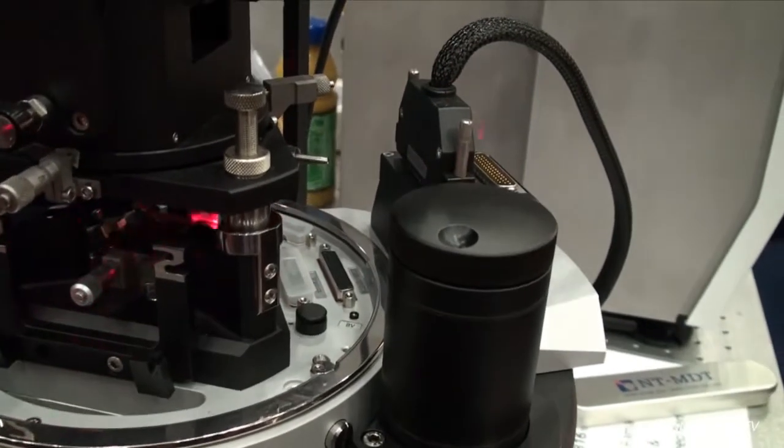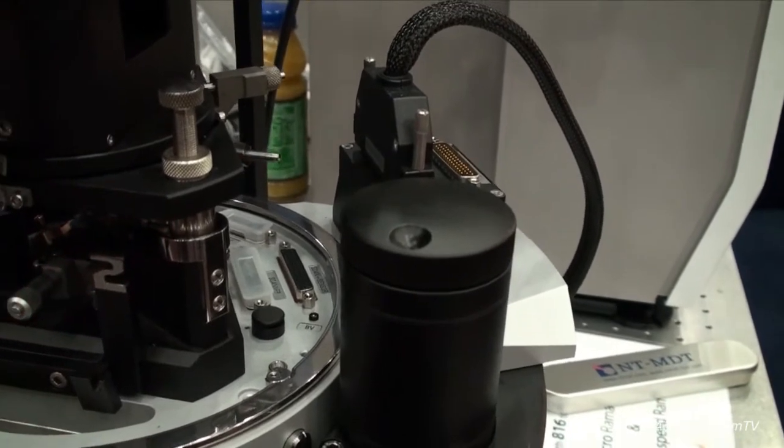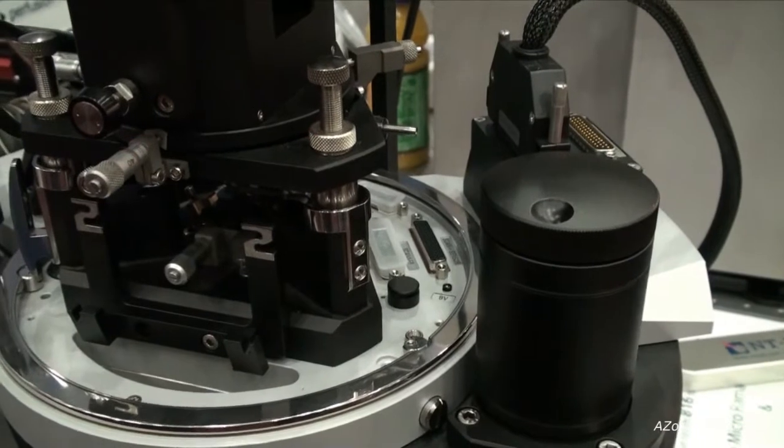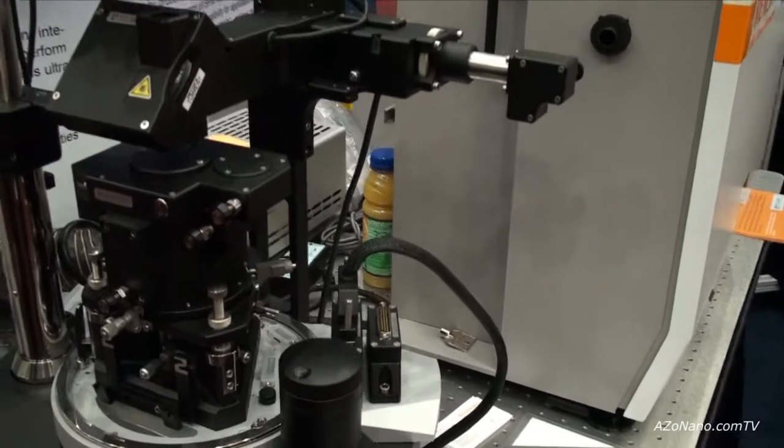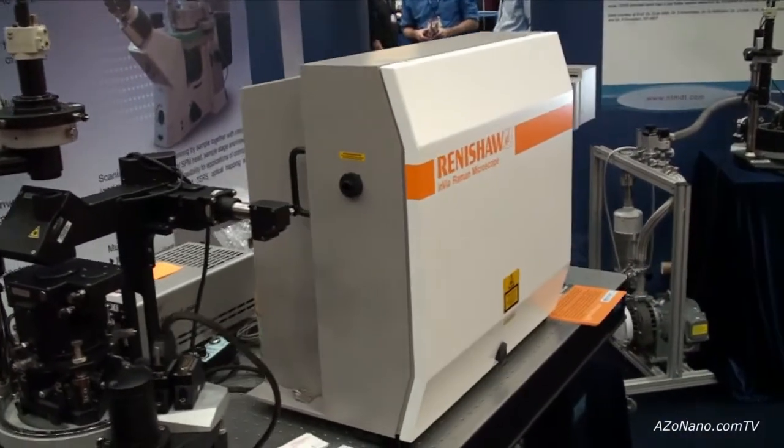To do that, you see this triangle has no scanner anymore. It has internally built objective which together with special optics—which is actually an optical microscope—provides the connection to the Raman spectrometer, which is a Renishaw spectrometer.